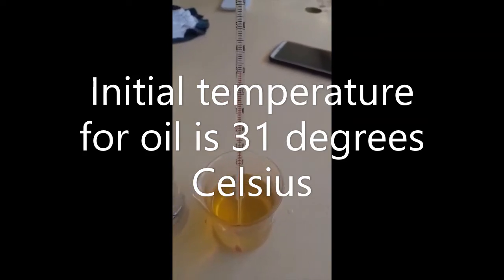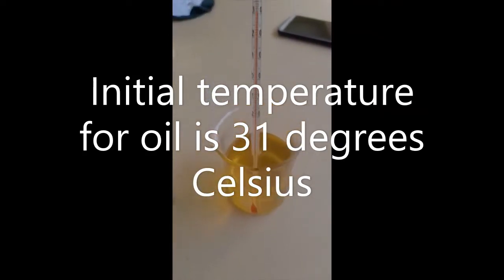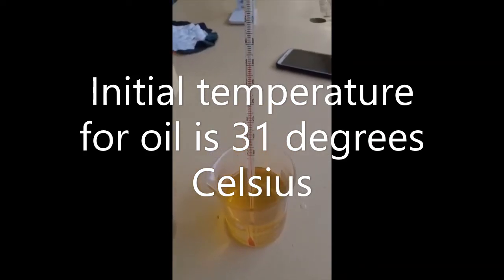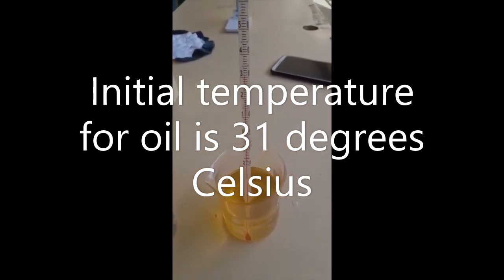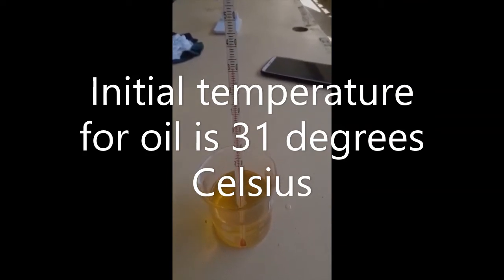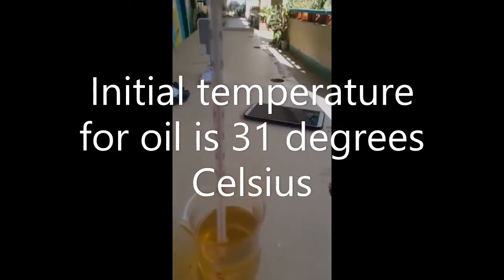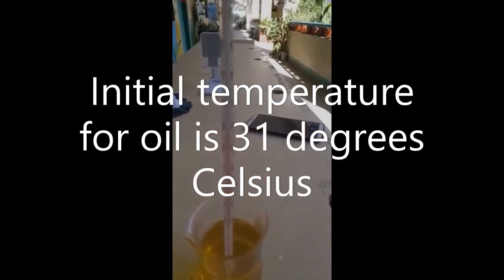So we get the initial temperature of our cooking oil. I think the thermometer is steady, it doesn't move. The red line doesn't move anymore. So we have already the initial temperature.